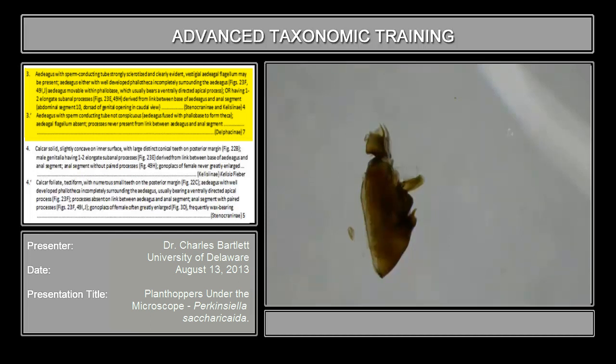We get to a point in the couplet where it reads: or having one to two elongate subapical processes. Here is segment 10, and this is segment 9. If the subapical processes were present, they would be extending out from here. That is a feature of the subfamily Kelisiinae. If this were Kelisiinae, the suspensoreum — which is present right here — would be absent also. So all of these things suggest we need to go the other direction in this couplet.